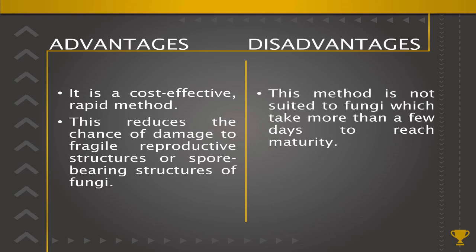Disadvantages of these slide cultures are: as the agar medium used contains a limited nutrition source, fungal pathogens will survive for a short time period. Therefore, this method is not suited for fungi which take more than a few days to reach maturity, for example, members of Scedosporium and many fungi isolated as endophytes.